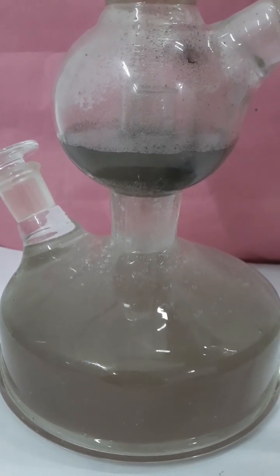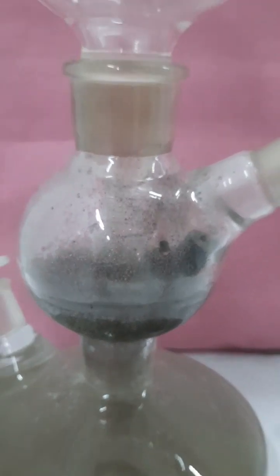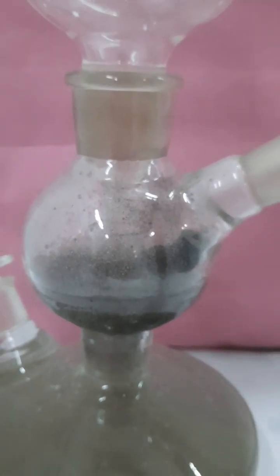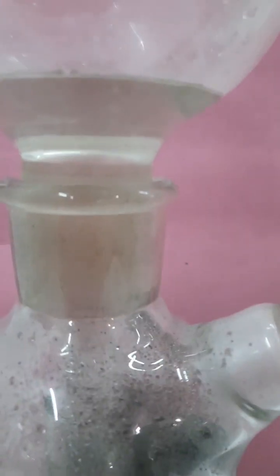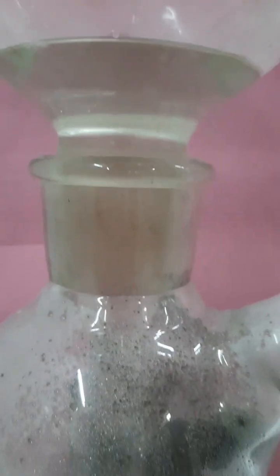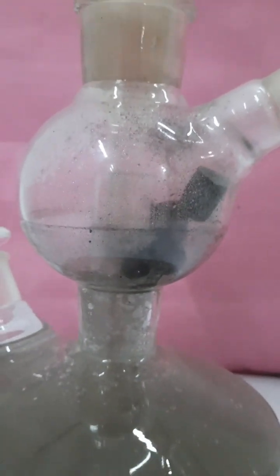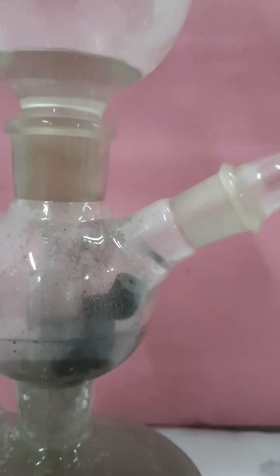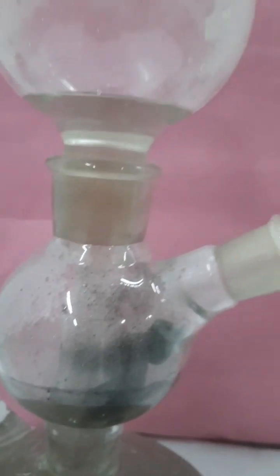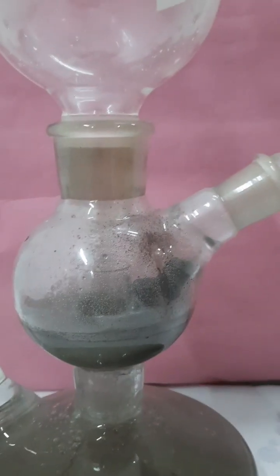The preparation of H₂S can be controlled in this way. When a sufficient amount of H₂S gas is released in the middle chamber, the pressure inside increases and pushes back the dilute sulfuric acid into the lower chamber. It rises through the long tube into the upper chamber. The level of dilute sulfuric acid is clearly observable as it ascends into the first chamber.